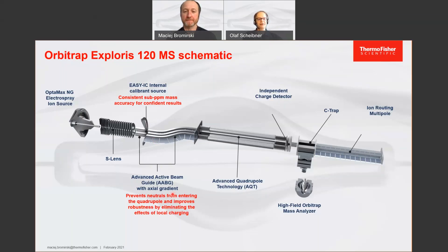This is followed by an S-shaped ion guide that prevents neutrals from entering the system, because the neutrals fly straight while the ions follow the S-path and enter the quadrupole. The quadrupole is a segmented quadrupole for better isolation shape and better transmission, increasing the sensitivity of the system and isolating down to 0.4 Dalton in isolation width. Behind the quadrupole, we have the new independent charge detector, which ensures the instrument always knows exactly how many ions are going into the C-trap to fill it with the optimal amount — maximizing sensitivity without compromising mass accuracy or quantitative capabilities, and ensuring the C-trap is never overfilled.